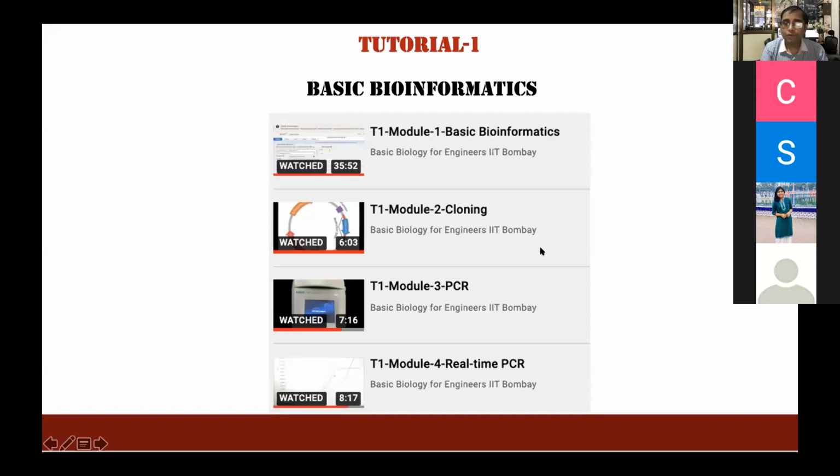Then some concepts of gene cloning, how to make multiple copies of the genes, and also how to utilize the polymerase chain reaction. Different reagents are required, especially the primers. How to design the primer sequences is very important, and you can see that in terms of SARS-CoV-2 detection. You really want to detect only the pathogen of interest. So the gene which you want to amplify has to be really unique or specific, and that you can only achieve using the primers. So primer designing and primer sequence become important. Some of these things are going to be covered shortly.